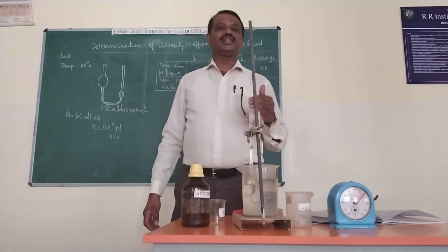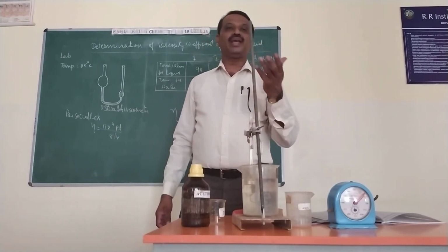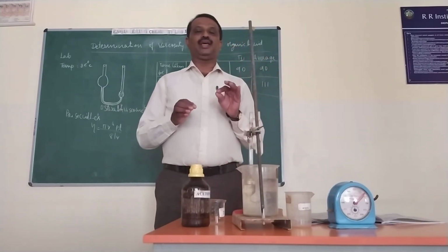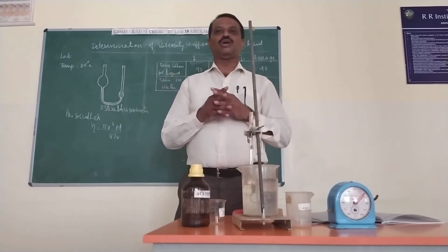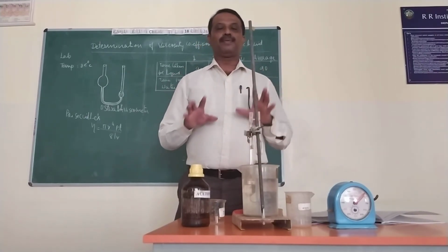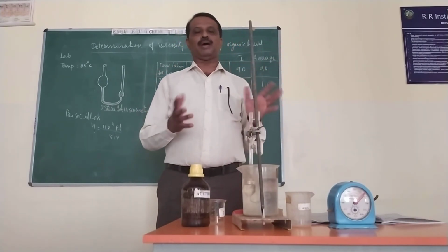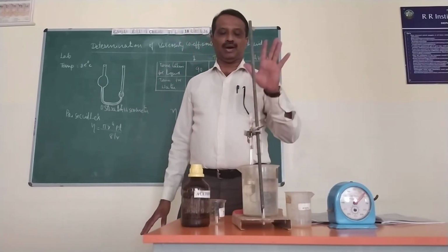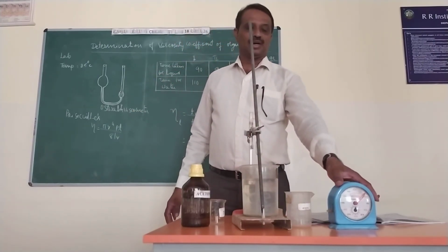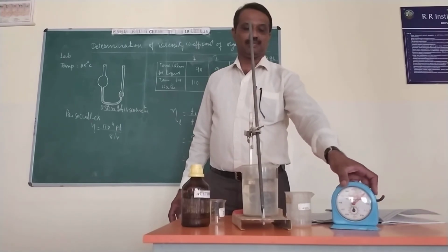We have taken these 3 trials. Out of these 3 trials, a little bit of variation will come. So instead, to measure the viscosity coefficient of the given liquid, we have the better option to dip it into this water bath containing tap water. Tap water we can use. So now we have to fix it. Afterwards, we use this for the time taken calculations.